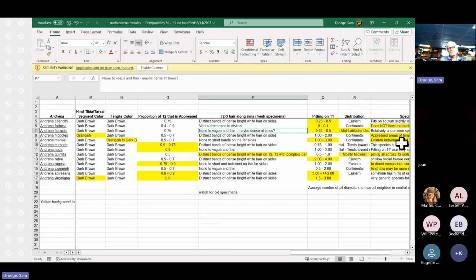So in some of these kinds of situations, is there regional variation, or are we looking at more than one species and we're not differentiating them well because it's very messy? Hard to say, but we are very close right now. I'm going to pull another specimen. We're very close right now to having molecular capabilities with nanopore technology to begin actually doing some species work.